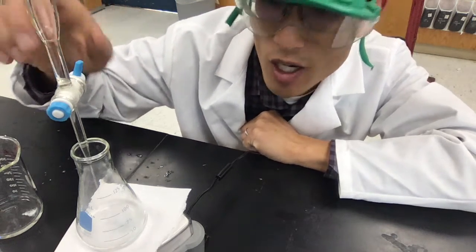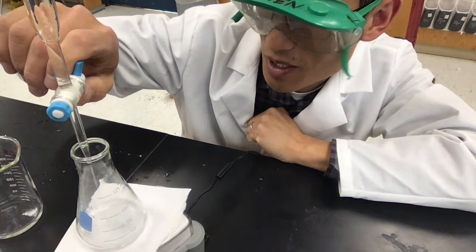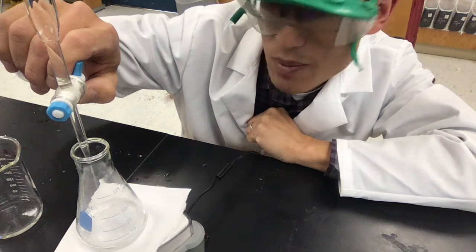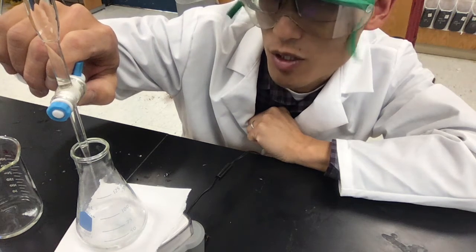So this is a fast run. You typically are going like this to see approximately when it turns pink. If you are limited on time and you don't have time to do multiple trials, then do the slow run first.